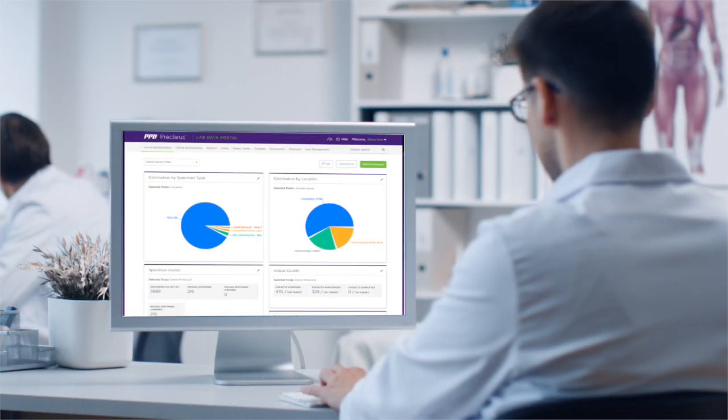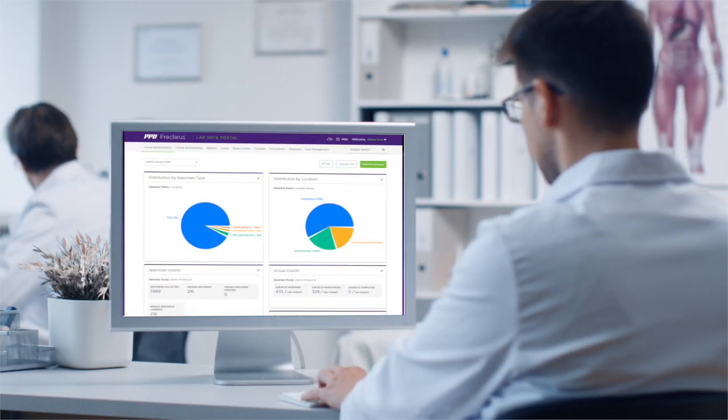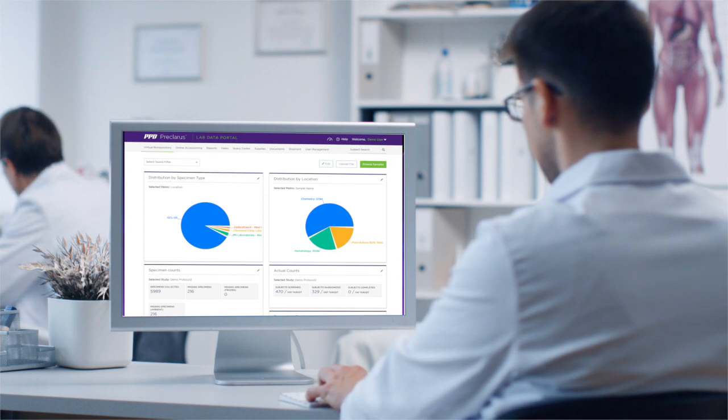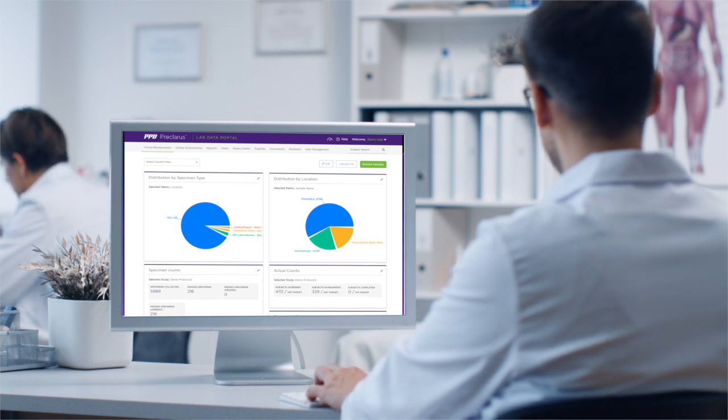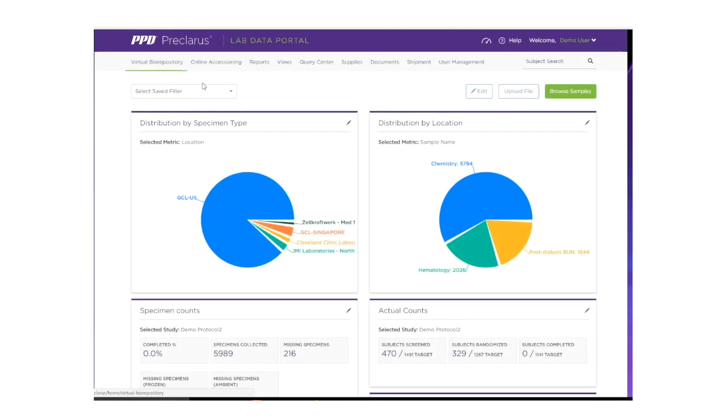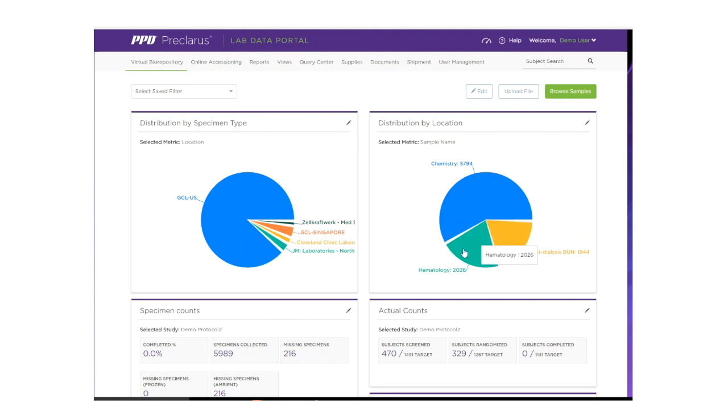One of the most innovative features in the Preclarus Lab Data Portal is the virtual biorepository. The biorepository widgets provide a high-level view of your specimens. Location, count, type, and status are all clearly displayed.